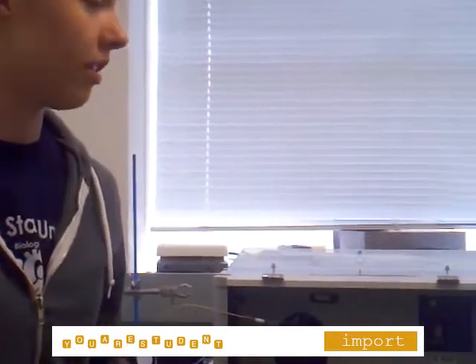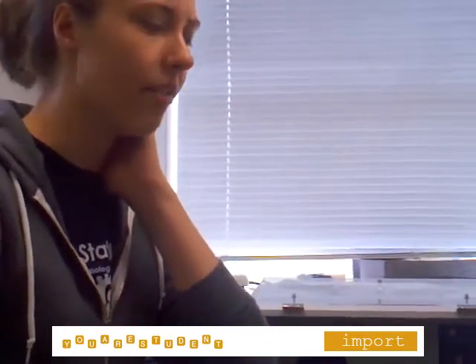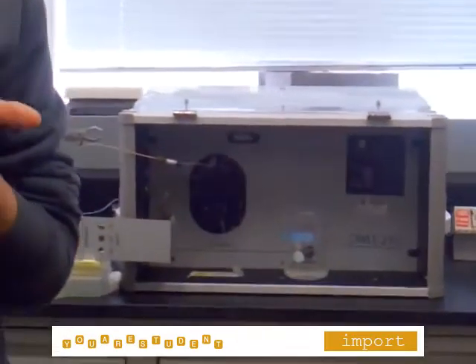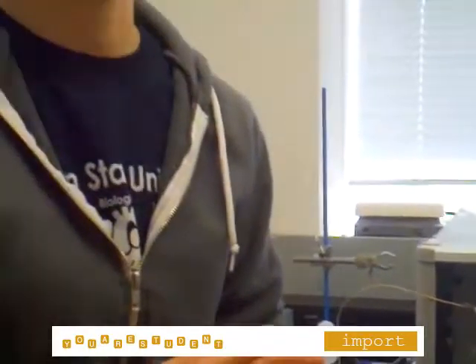So our lab wrote a grant proposal, and OSU's research office has grant money that you can get to buy new machines. We also have a grant, I can't remember if it's from the National Science Foundation or the National Institutes of Health, but those two organizations give a lot of funding. So we got this machine, and it uses glass slides, and you can flow different solutions past the surface to see how they'll stick.